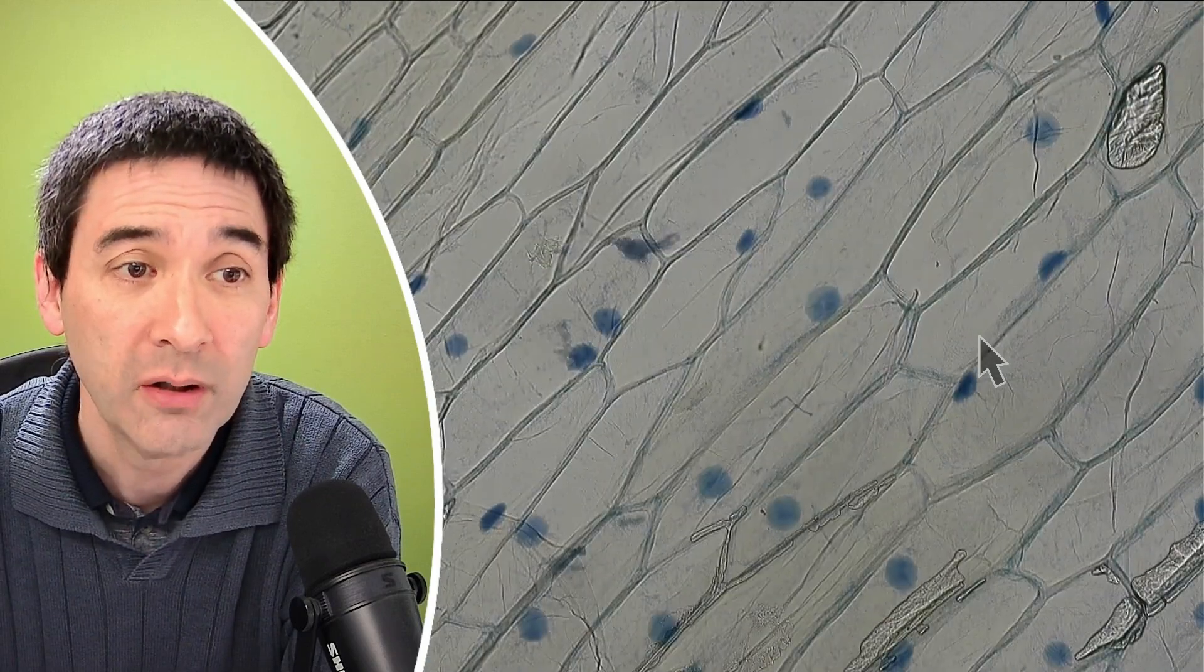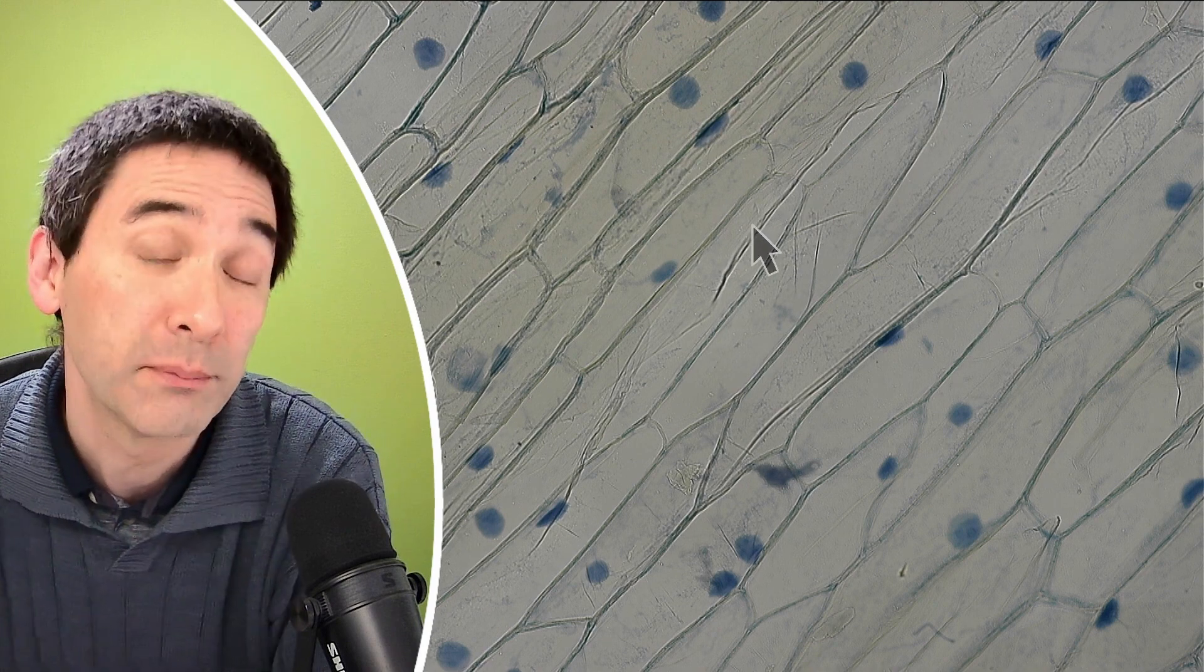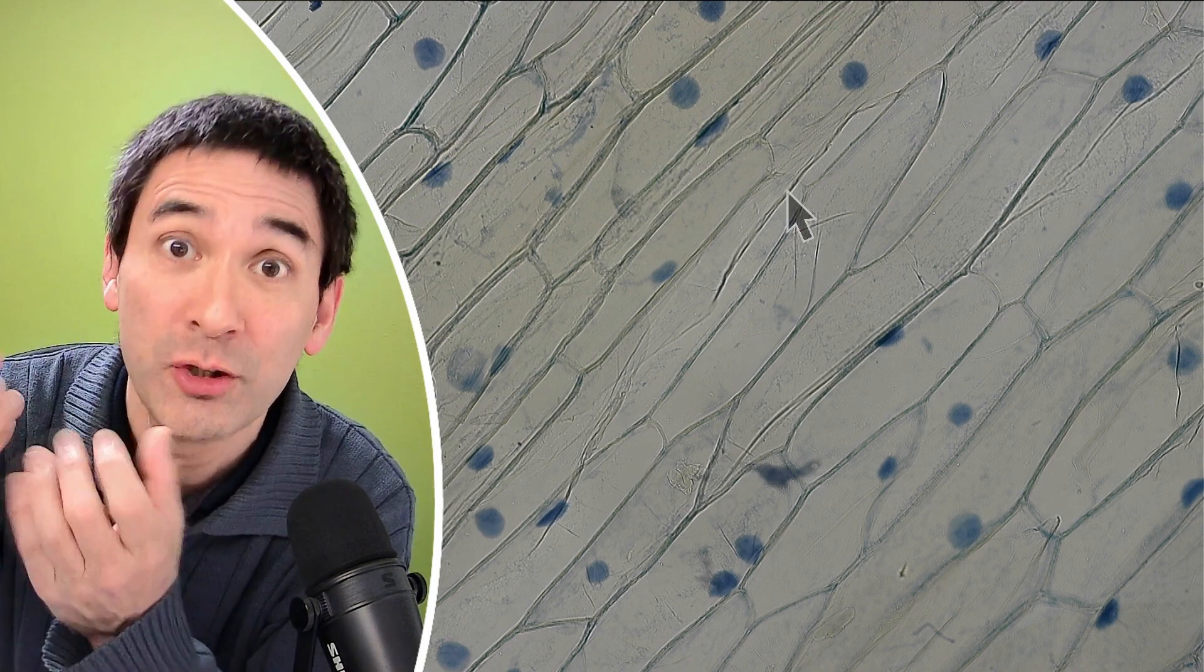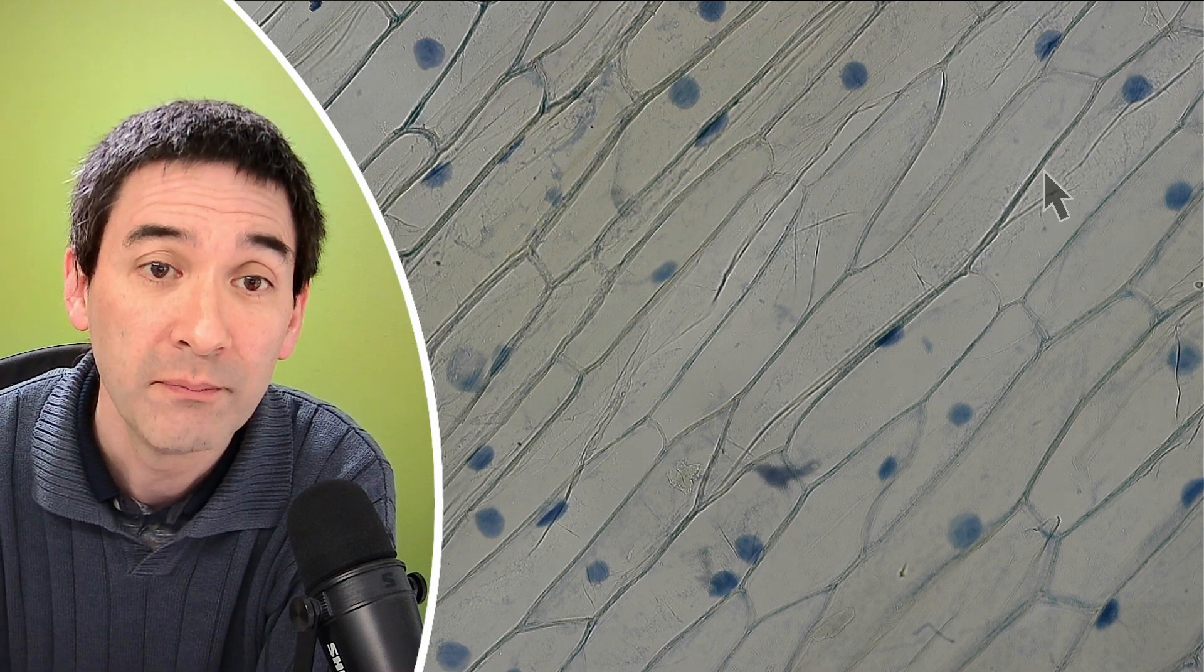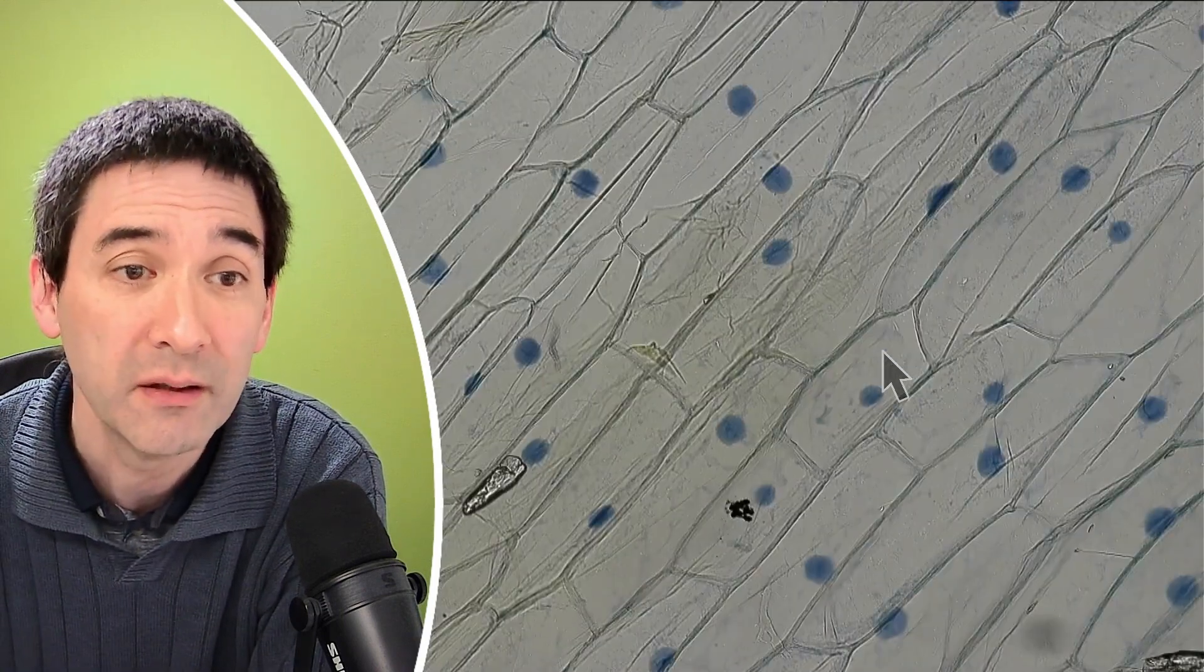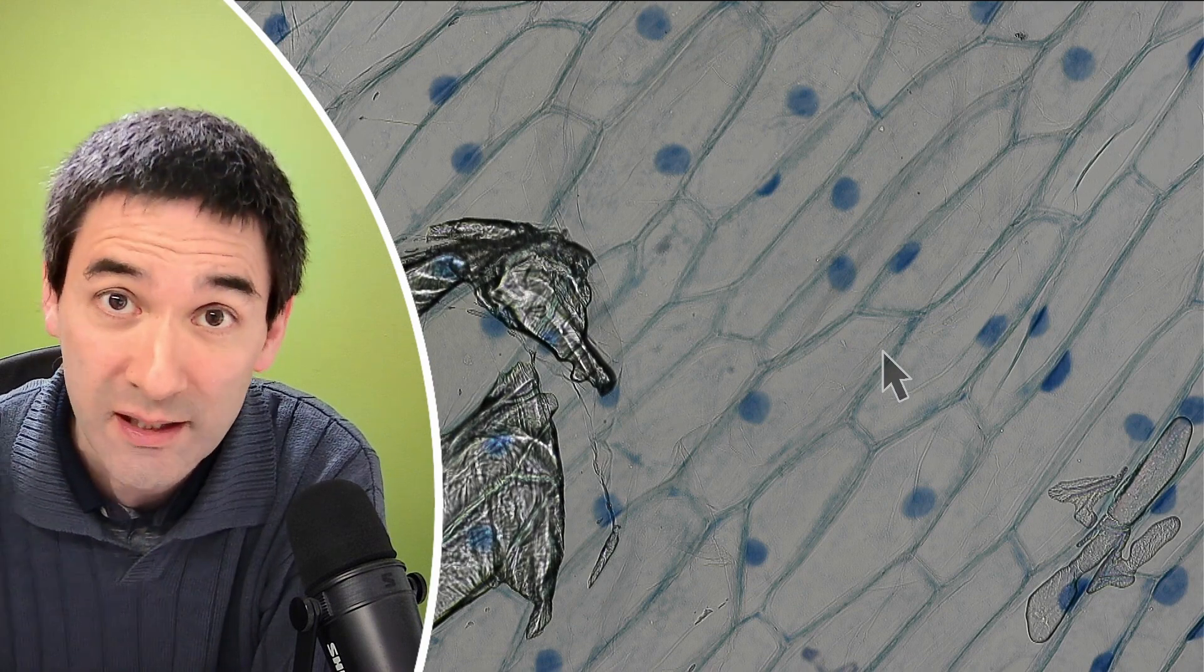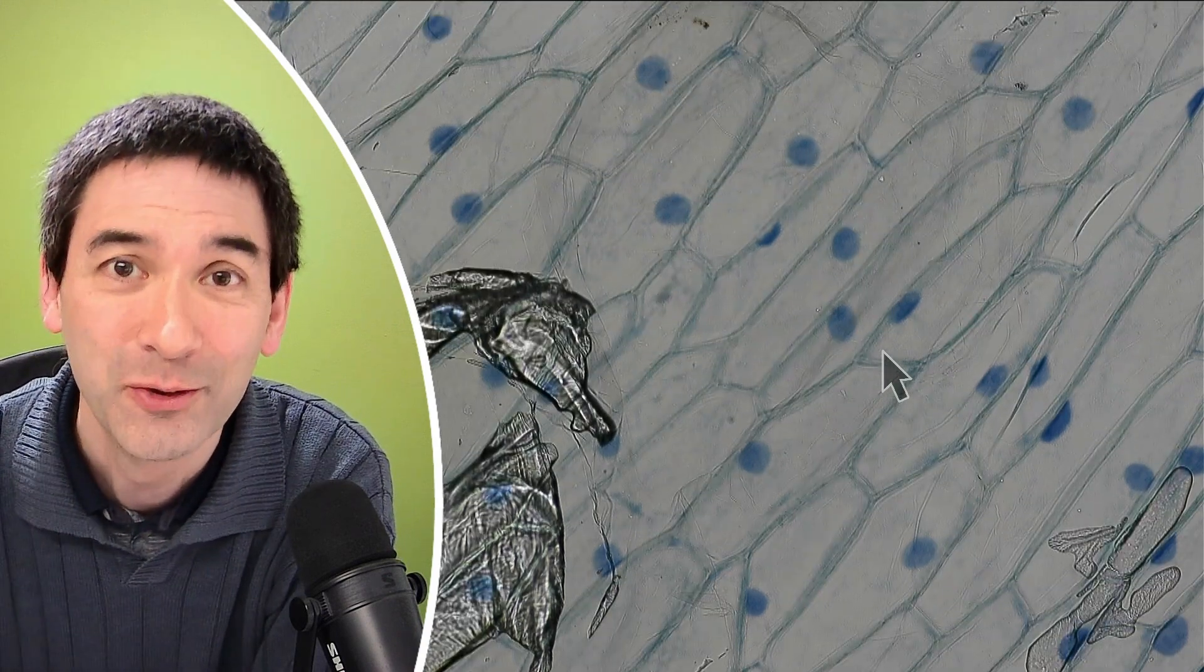So here it's kind of a little bit like expected. And however, there are over here, this cell over here doesn't seem to have one. I have a suggestion of why this could be. And the reason is, I think that during the preparation of this onion skin, when I ripped off the skin from the remaining onion, I might have damaged the cell. And then the cell contents has flown out. Like for example, this one over here also doesn't seem to have a nucleus, but the surrounding cells all do. So basically, this is almost a little bit what we would expect. Pretty much all of the cells have this structure, this nucleus in them.